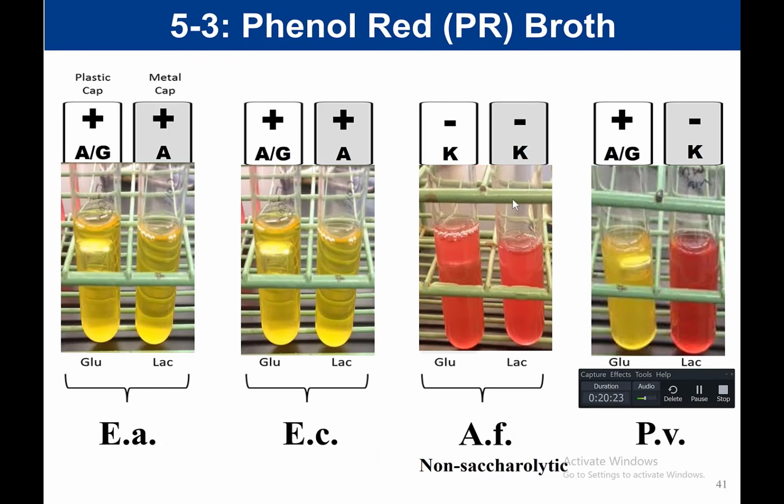You do not need to memorize the results of this experiment. I will not ask you what was E. coli's reaction or what was Proteus vulgaris's reaction. I don't care about that. What I do want you to take away from this is that if you were shown a tube like this, you should be able to tell me what that tells you, meaning what your interpretation is.